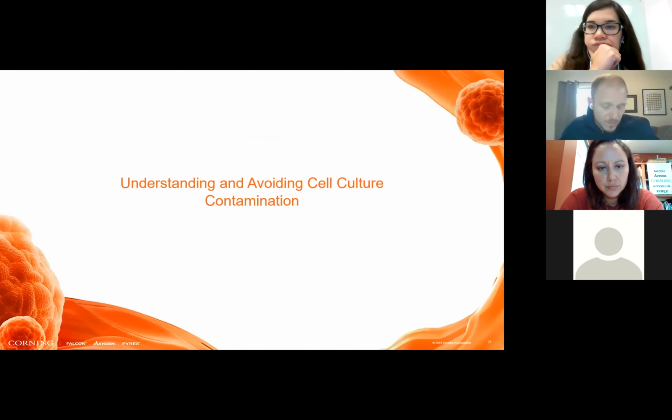All right. So I think we've thoroughly gone over an introduction to cell culture and some of the best practices. Now what I'd like to do is talk about specific considerations around avoiding contamination and best practices to ensure that you are maintaining a sterile work environment.